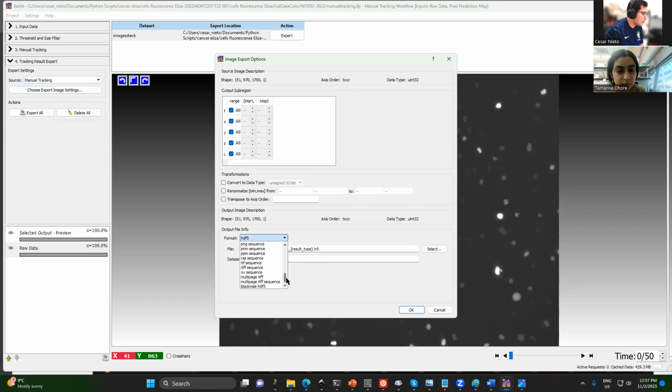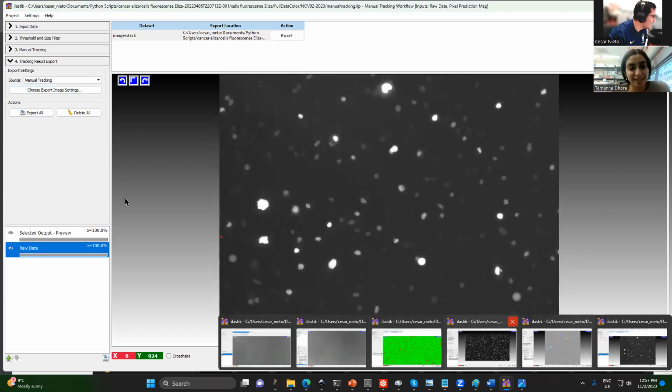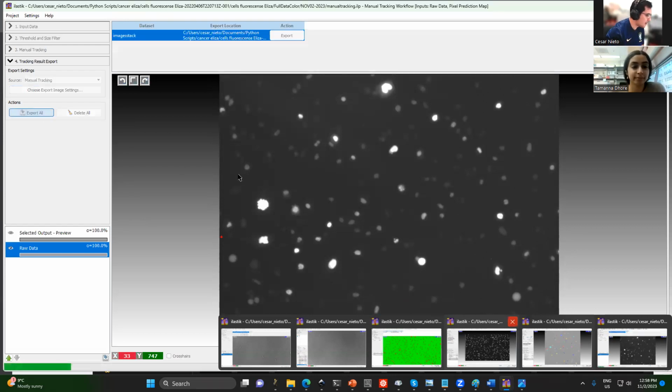In Python, I was trying to read H5, but I failed. Okay, let's see what this does.